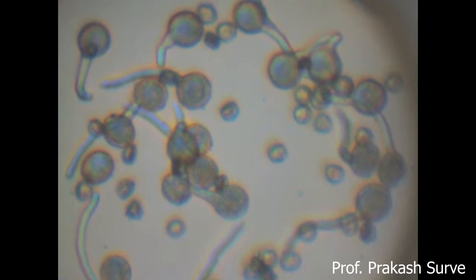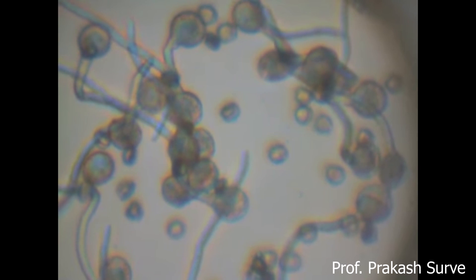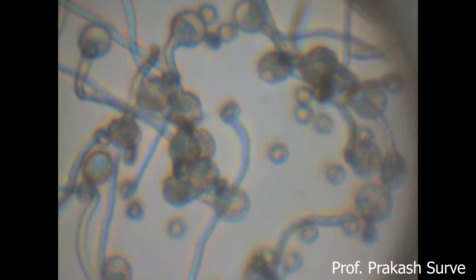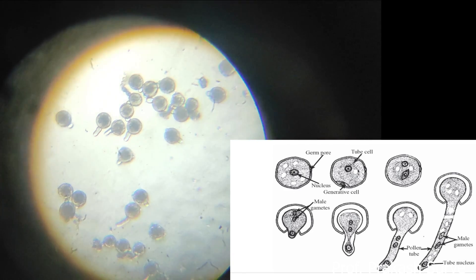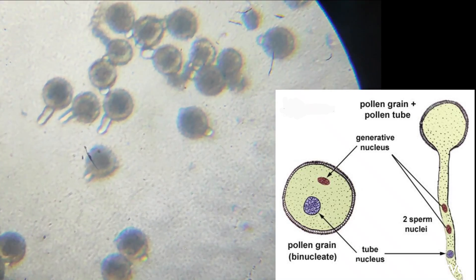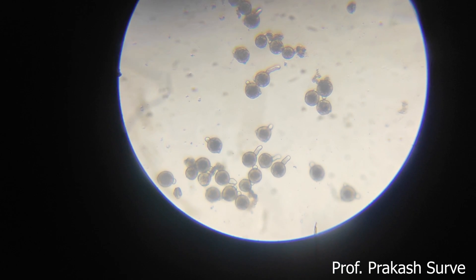A number of pollen tubes can be observed — each pollen grain produces one pollen tube, and sometimes two or three pollen tubes also. We can clearly see how the pollen grains are germinating by absorbing the sugar solution. The pollen grain has the exine and intine; when it absorbs the sugar solution through the germ pore, the inner volume increases and the intine comes out from the germ pore in the form of the pollen tube. This is in vitro germination — that is, germination outside, in the artificially prepared sugar solution.